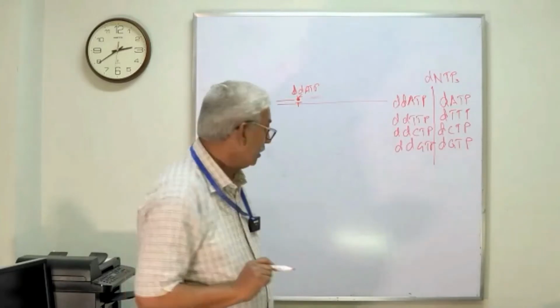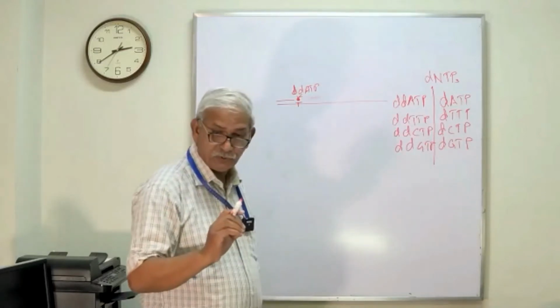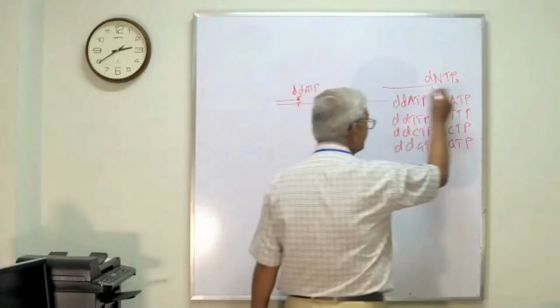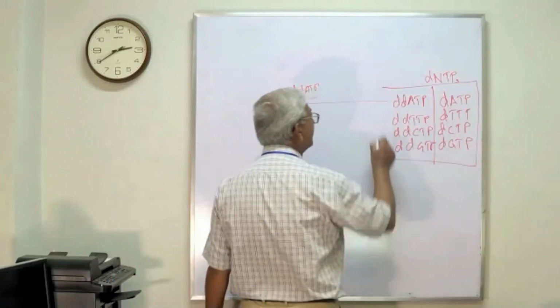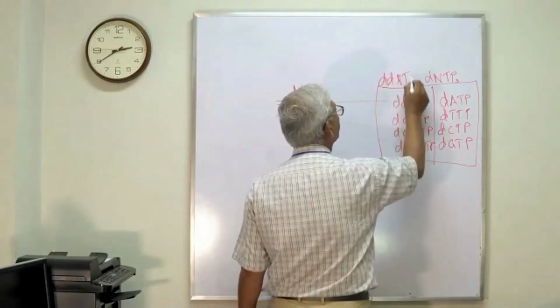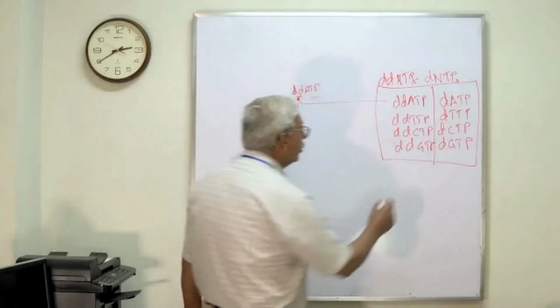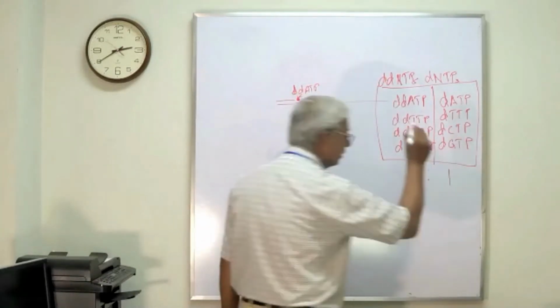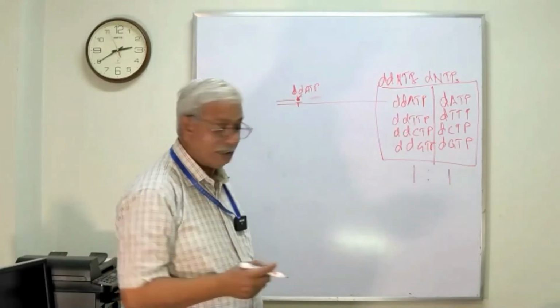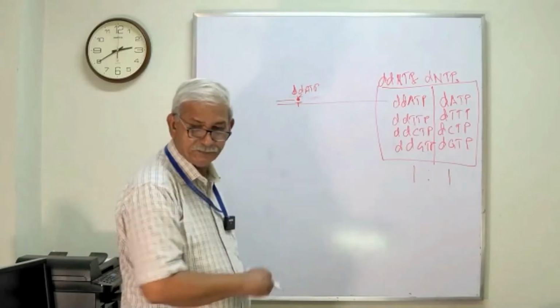Okay. Now, just imagine that this mixture of the deoxy and dideoxy have a ratio of 1:1 in the sequencing reaction mixture. What will happen?